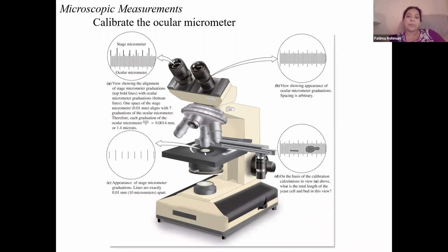Okay, now, specimens that we will look at, some of them are going to be stained, obviously, with different dyes, so you can see the cells and the organelles a little bit better. Other times, you're just looking at bright field images where you don't actually have any stains. The cells are the way they are. Now, most of the cells that we're going to be looking at are going to be pretty translucent, right? So it's like clear on clear.